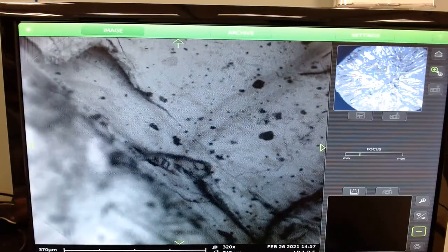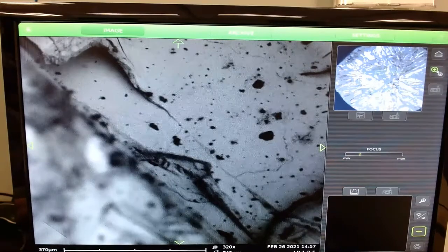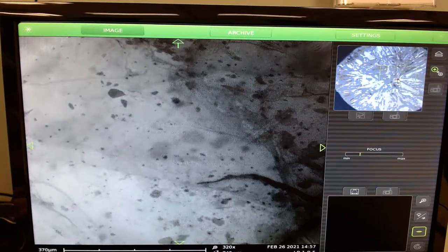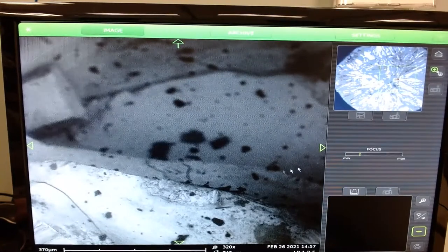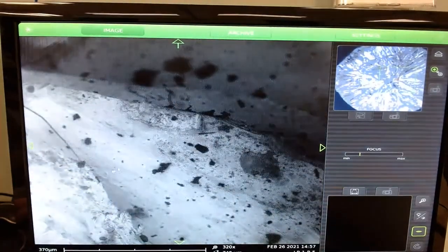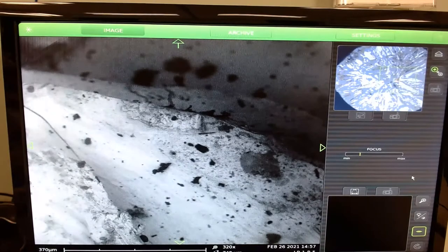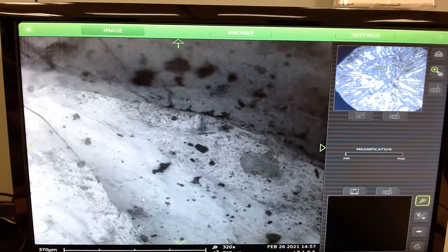Okay. How much farther in can we get? How zoomed in can we get? It looks like we're pretty close to the minimum amount of focus. Well, there's usually just a small range of focus in the lens where it'll show you something. All right, so how many times can this bad boy go? Like how much can you zoom in? 24,000. Let's see some 24K up in here. I don't know how much we're gonna see. Yeah, let's go down here.